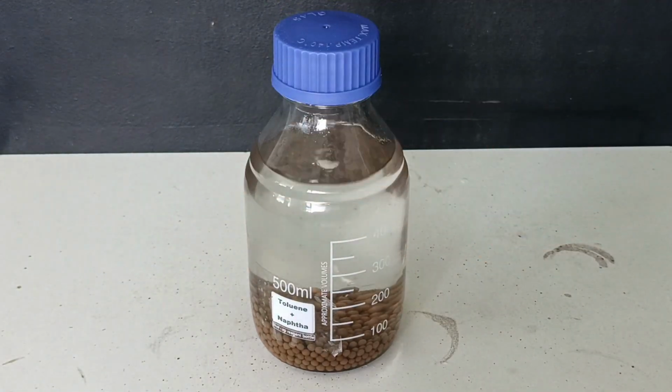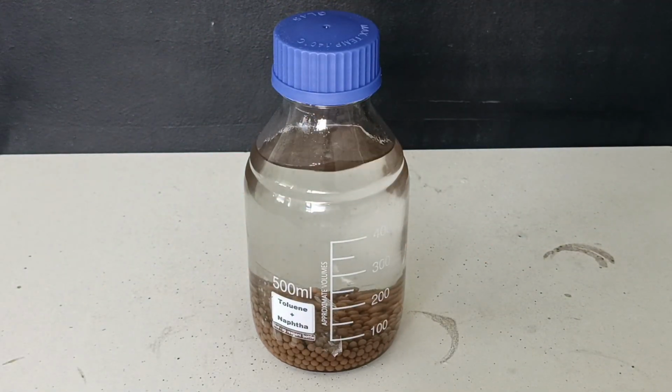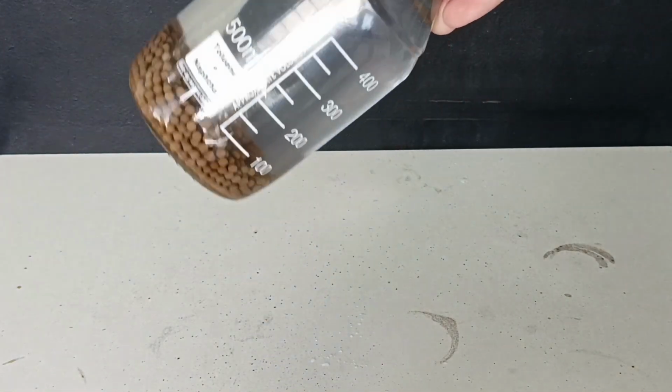Here's the final product. I was able to get around 500 milliliters of my toluene from 1 liter of lacquer thinner. Unfortunately, this still contains around 30% naphtha, which I will have to clean by distilling it off, and I'll do that in a separate video. For now, I stored it with some molecular sieves.